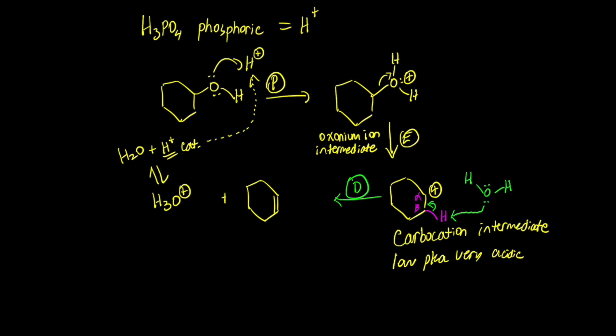So the experimental procedure, as you will see, is to measure out 10 milliliters of cyclohexanol, add it to a 50 milliliter round bottom flask, okay? And we're going to add 3 milliliters of phosphoric acid. Okay, this is going to be the limiting reagent. So you need to use the density and the molar mass to figure out how many moles that is.